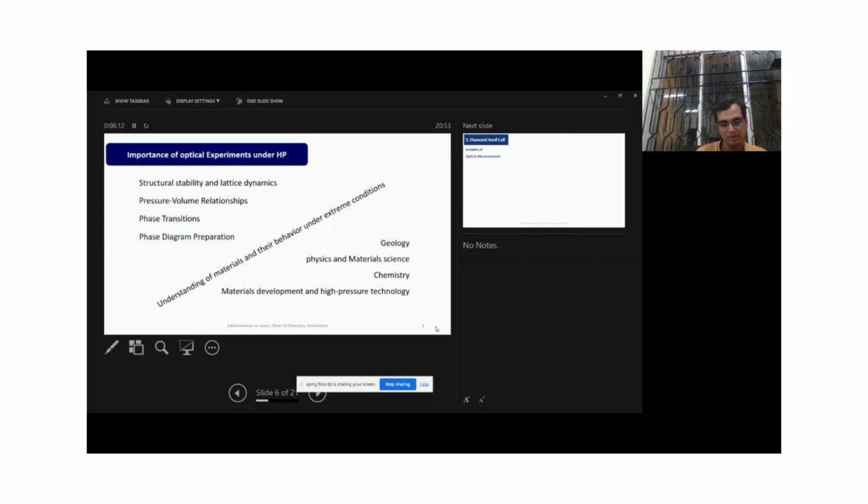For example, any kind of property could be changed. For example, the material from insulator to semiconductor, and then metal, to say conductor, and then superconductor. Yes, the same sample could be converted in all the phases of the conducting properties. Again, a material that is an insulator could be converted into a semiconductor, and then to a conductor, and then to a superconductor, which could be possible.